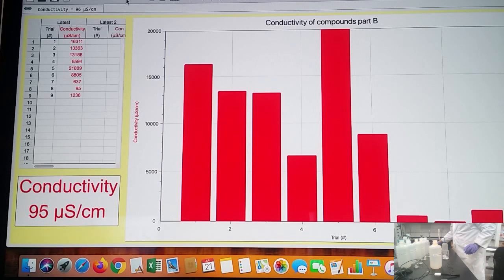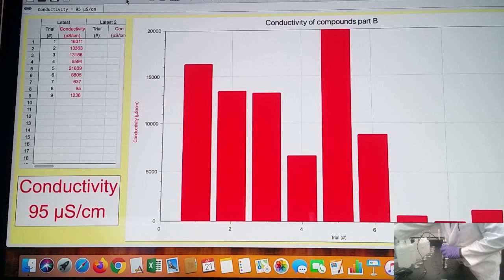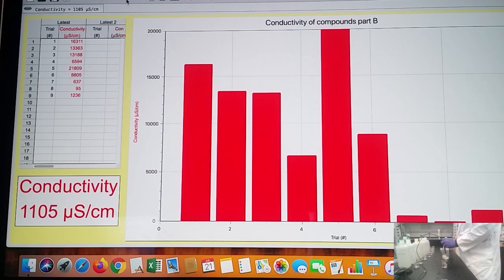This is ammonia in water. When you put ammonia in water, it makes ammonium hydroxide, or ammonia cleaner. And we'll put that in our last beaker here. All right. That concludes the data collection for this particular exercise.